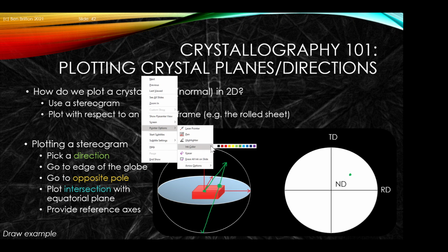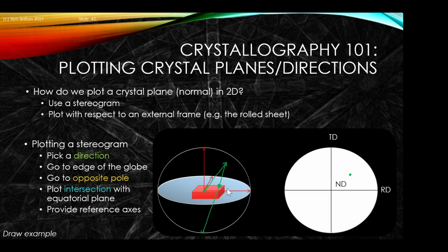If I change and move that point further out, so I go for a less steep vector, we can see it will go down. We follow the same recipe. We then plot it further out, and we can see if it's effectively collinear. Sorry, it contains in that same zone, apologies, cozonal. Then we can see it will be pointed out there. So the distance, the angle here, between this point and this point, is describing a relationship and it can be calculated, but the angle theta is encoded in that distance.